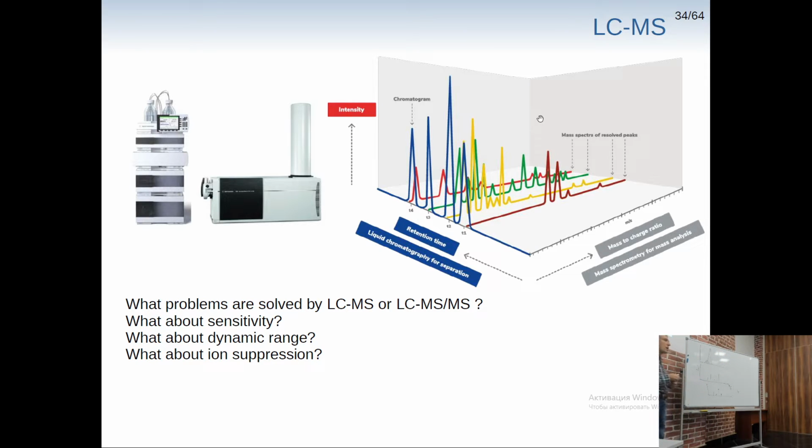So we have to somehow get some rules. Which of them will we try to fragment and at which time? For instance, if we know all the information, of course we'll try to fragment and get information on the green one here, on the black one here, on the blue one here, and on the red one here.